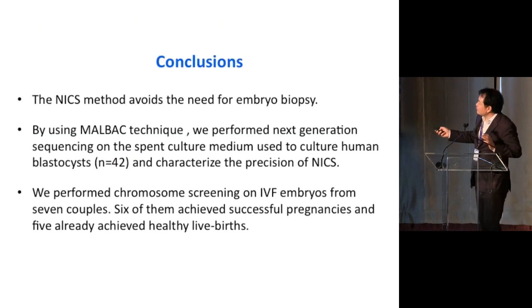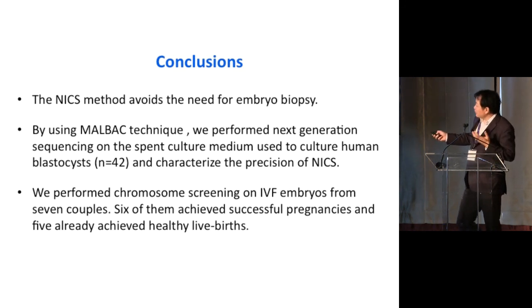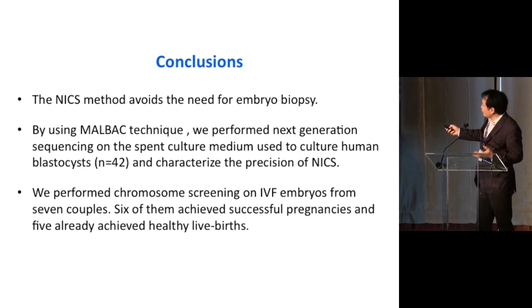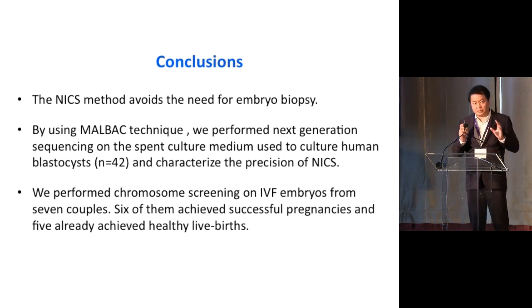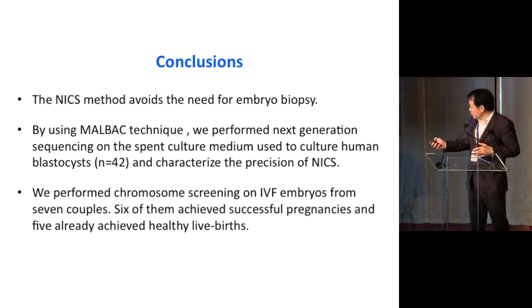So in conclusion, the NICS method avoids the need for embryo biopsy, and by using MALBAC, actually LIANTI as well, we can perform the next generation sequencing on the spent culture media. And we have characterized the precision, and I think the precision is good enough, and it's actually quite good considering we're not even touching it. So 6 of them have achieved successful pregnancy, and 1 more needs to be born.